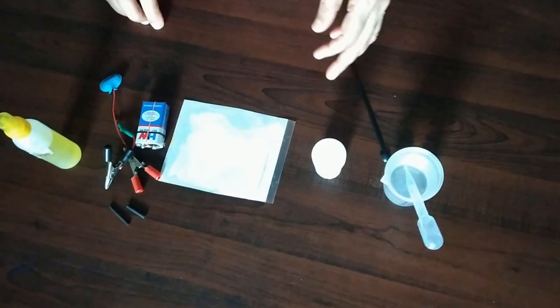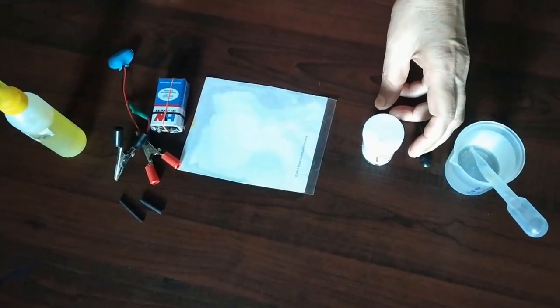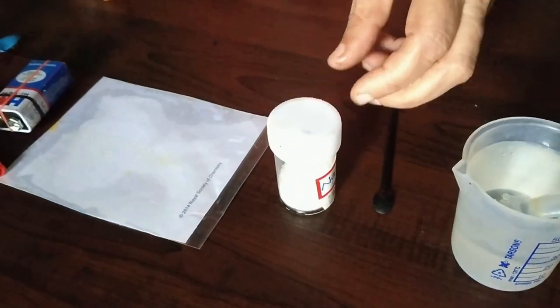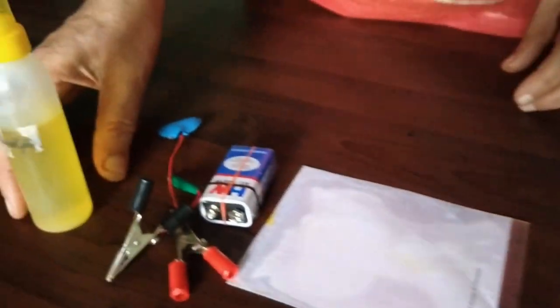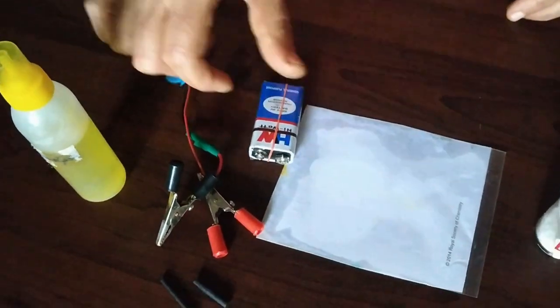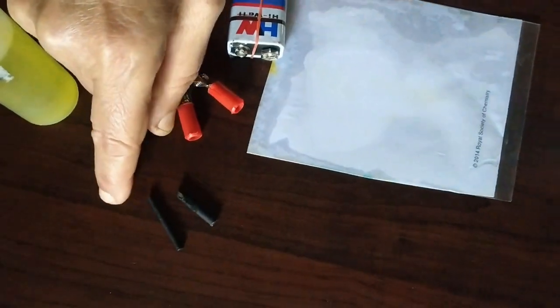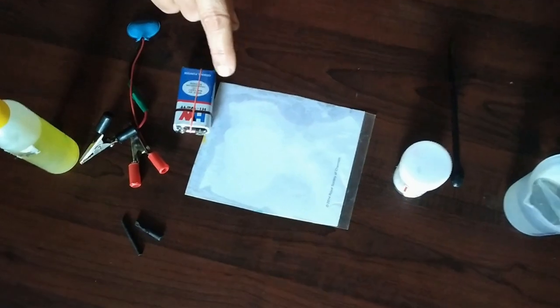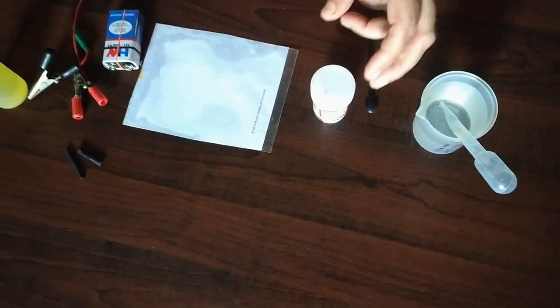Microscale experiment, electrolysis of sodium chloride. The materials that we require here are common salt, that is sodium chloride, and I have taken the indicator phenolphthalein. You can take any other indicator that you like. 9-volt cell, crocodile clips, and 2 carbon rods. You can even use pencil leads. I have taken these graphite rods from used dry cells, plus water.